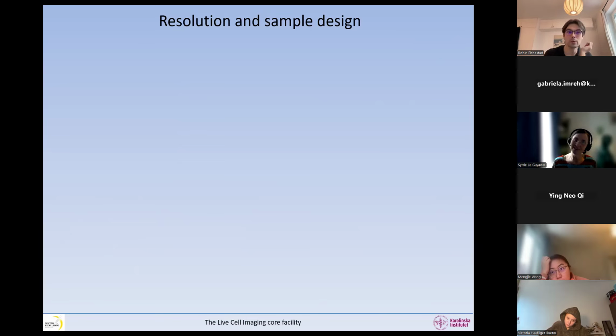Yes, super quick question. Maybe I should ask this to the one that has the microscope. But since the Airy unit is different in terms of microns for every wavelength, if you have a confocal system like the one I'm using, where you set, for example, Airy unit 1 and then image 3 different fluorophores, will the pinhole change all the time? Or is it because sometimes you see that it's standardized to 488, for example? Is the typical thing that it changes if you do it sequentially, or have you just set one pinhole that is the same for all the image acquisition?